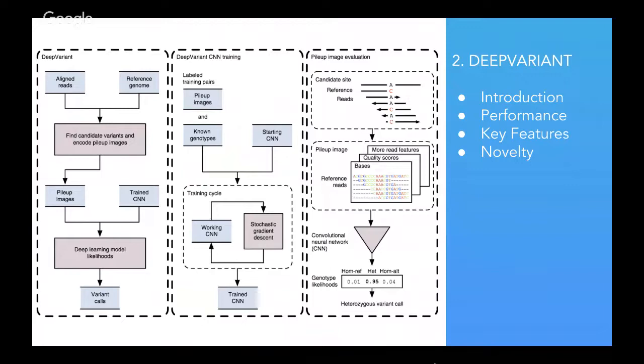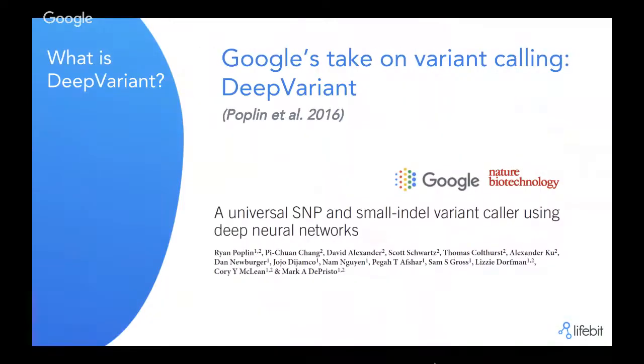And in order to train the DeepVariant models, you can use other kinds of information. It uses quality scores from the read data and also from the alignments, and you can add more features that might be related to the type of experiments or sequencing data that you are using. And after training the DeepVariant models, what is quite useful, as has been shown in the latest publications, is that it was initially published on bioRxiv quite some time ago, but has now been published in Nature Biotechnology.